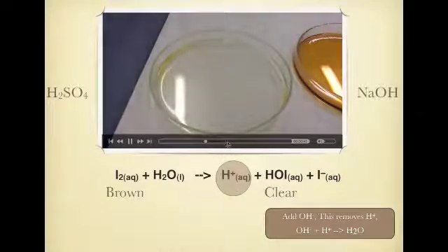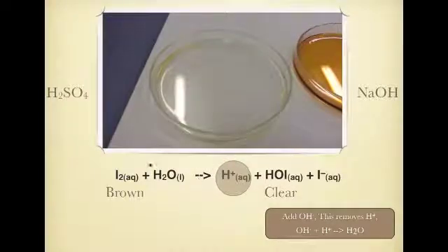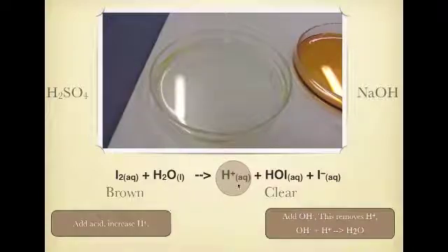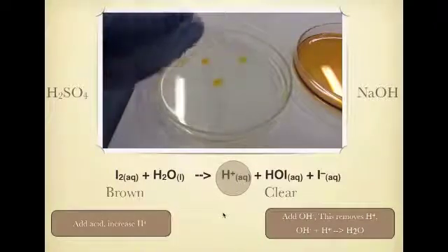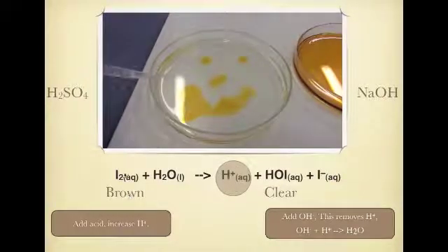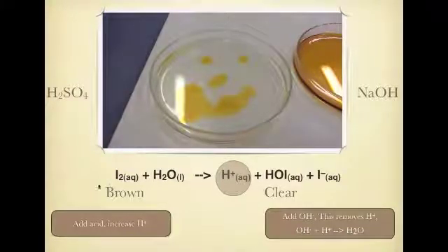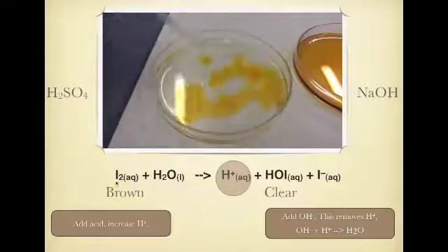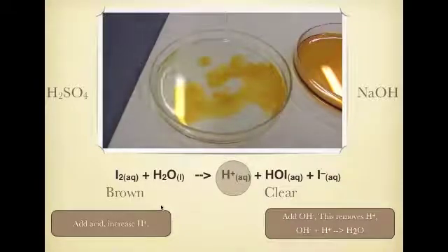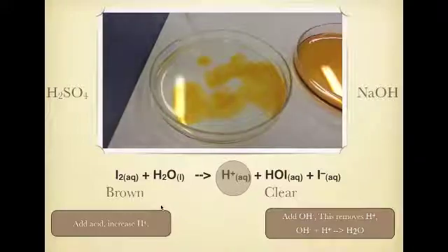I'll move it forward a little bit to about here, just because it goes for a bit longer than I want it to. And now I'm going to add the sulfuric acid, which is going to increase the amount of H+, which should see our back reaction occur. And when I add that in, lo and behold, everywhere I drop my sulfuric acid, I form this brown iodine solution. Now, this occurs pretty much like magic, which is awesome.